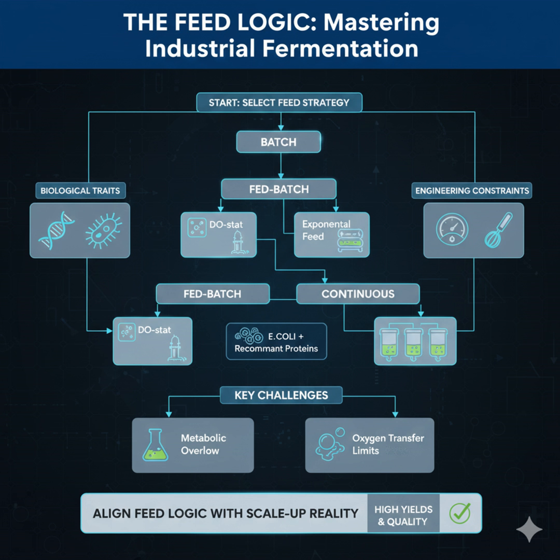This all brings us back to a unifying logic, doesn't it? It does. The feeding strategy is the primary tool we use to force the cells to operate in this narrow, highly controlled metabolic corridor. This corridor is where the product is formed efficiently and, most importantly, cleanly. Any deviation, and it's usually caused by an incorrect feed rate, creates unwanted side products, toxic acids, misfolded proteins, degradation, or just low-quality product. That means you have to do astronomically expensive downstream purification.